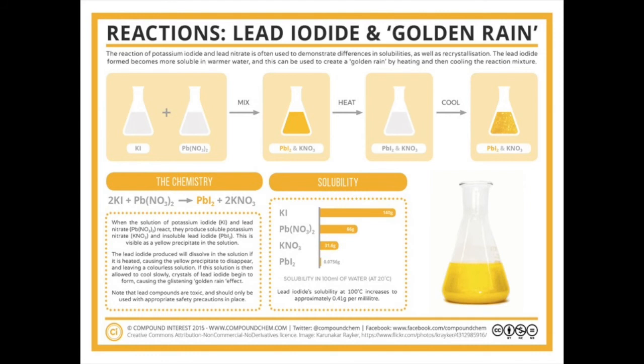I hope you enjoyed the video, and you should now have both a thorough understanding of how to perform the golden rain experiment and what exactly is happening based on the topics we have learned in class.